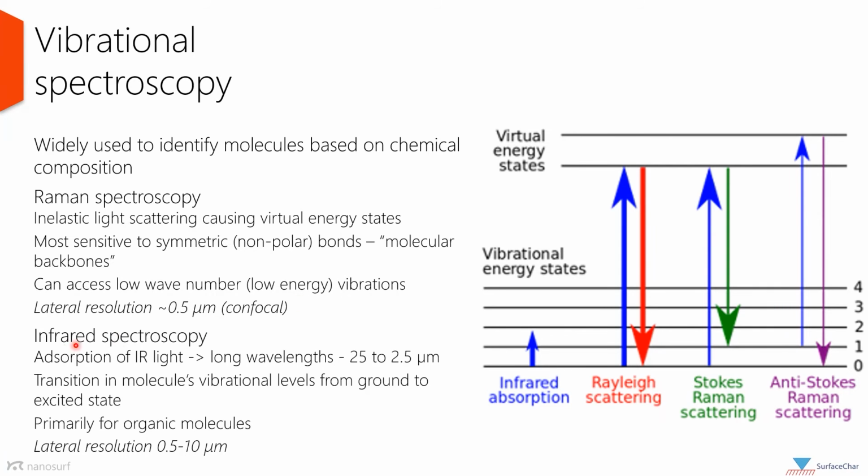Infrared spectroscopy takes advantage of the absorption of infrared light to excite vibrational states from a ground level to an excited state.